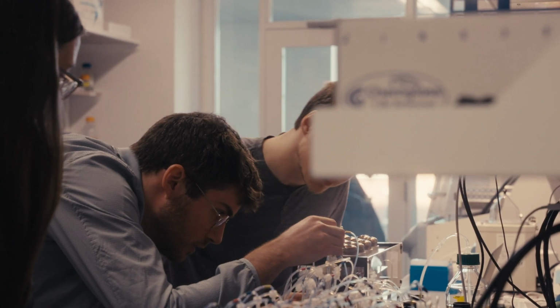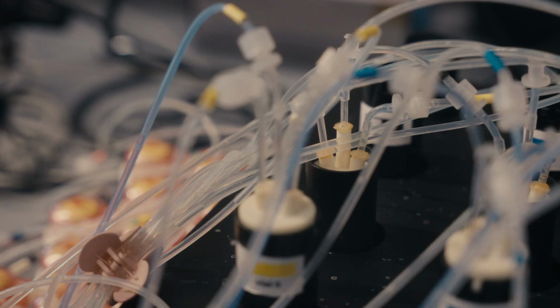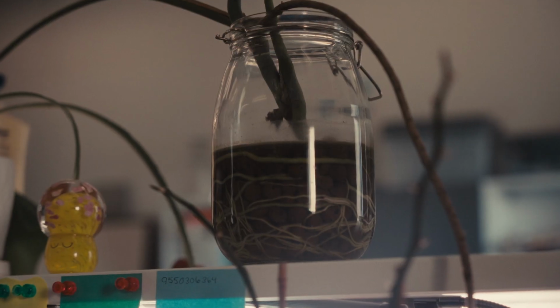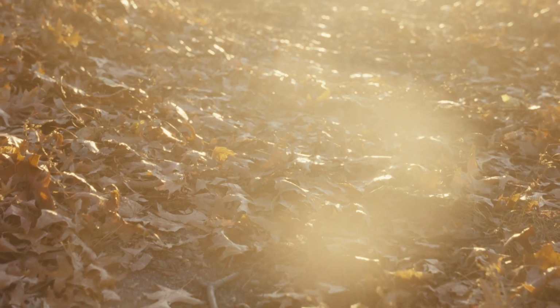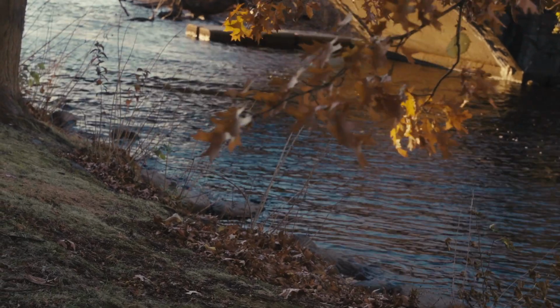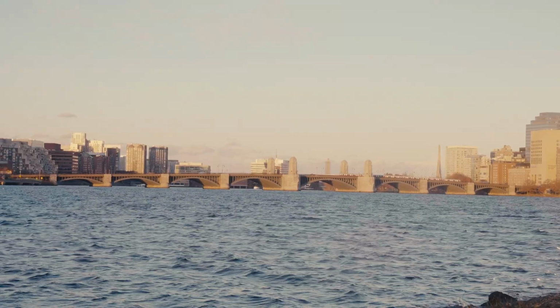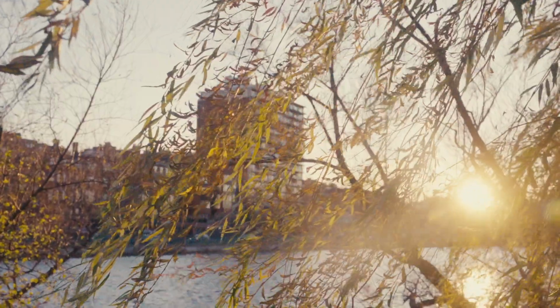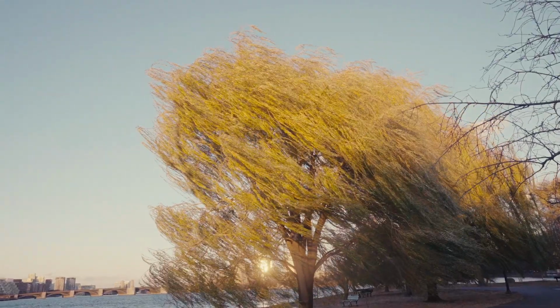The pilot projects that we did, the goal was to try to hit as many different departments as possible. So we had some in BME, we had some in biology, physics, bioinformatics. The microbiome project, basically what we're doing is next generation sequencing applied to detect if there's any pollution inside the ocean. There's also a regular soil sample to see if there's any pollution in the forest.